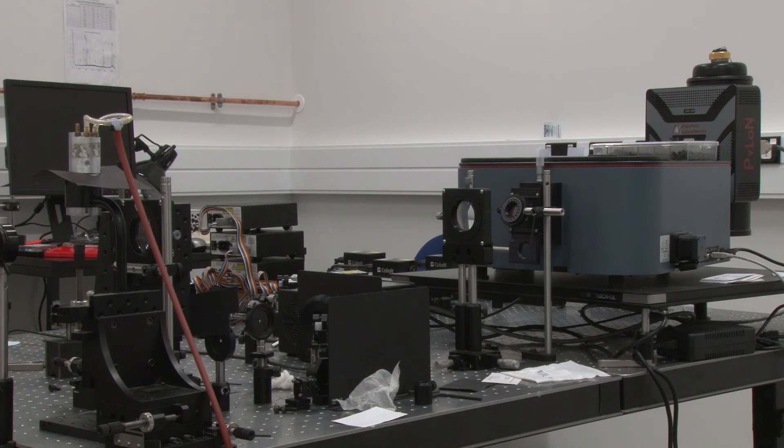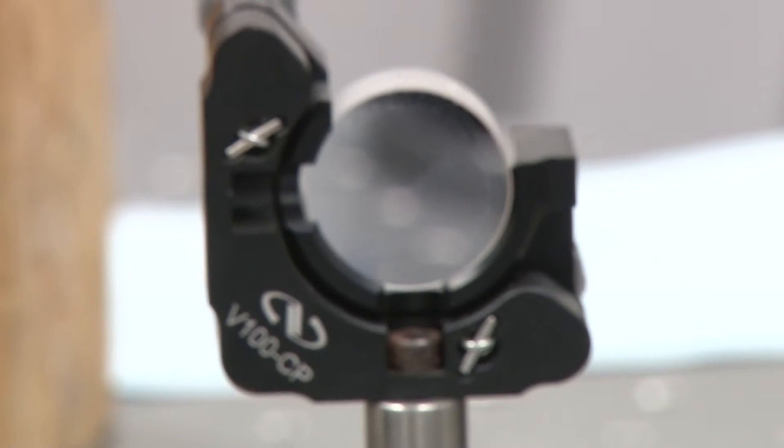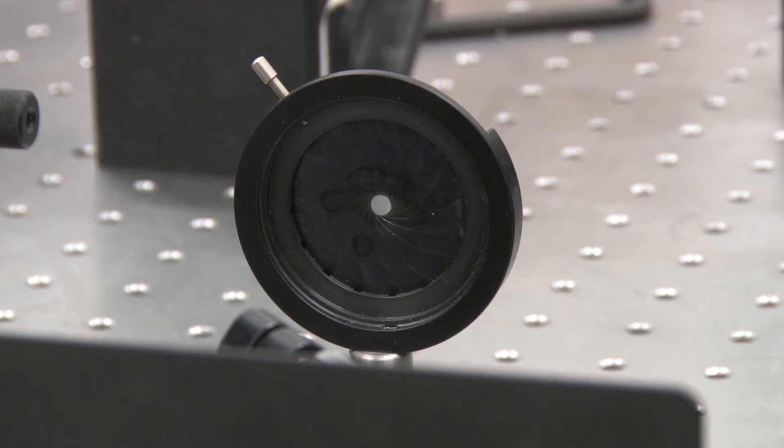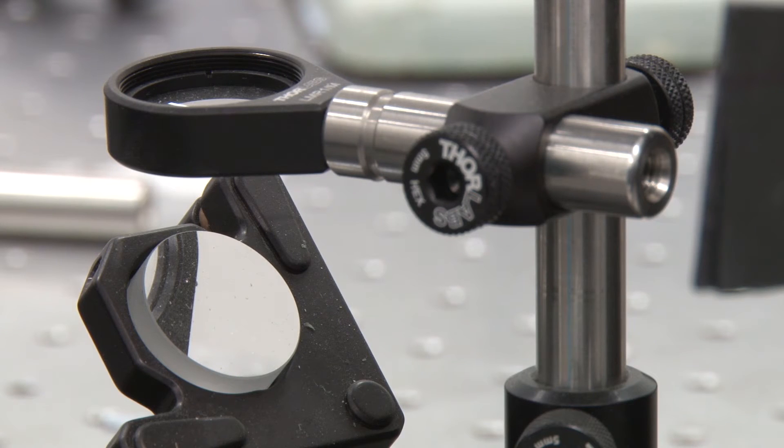So what we have here is the deconstructed box, right? These are actually the sorts of components that are inside those boxes except they're higher spec than in the manufacturer's machines and they're generally a lot more flexible.